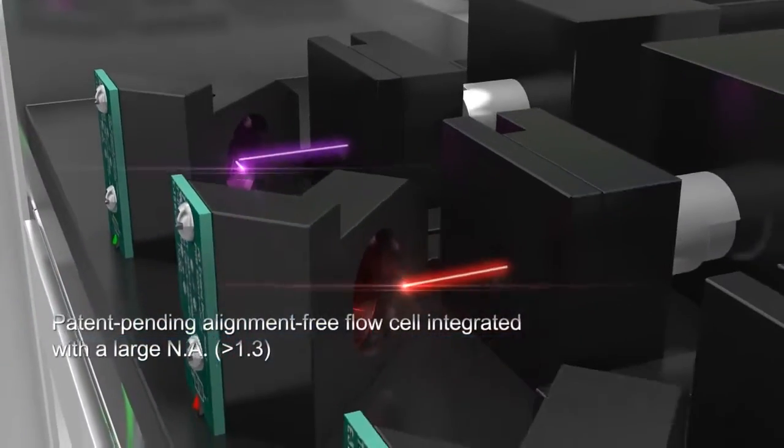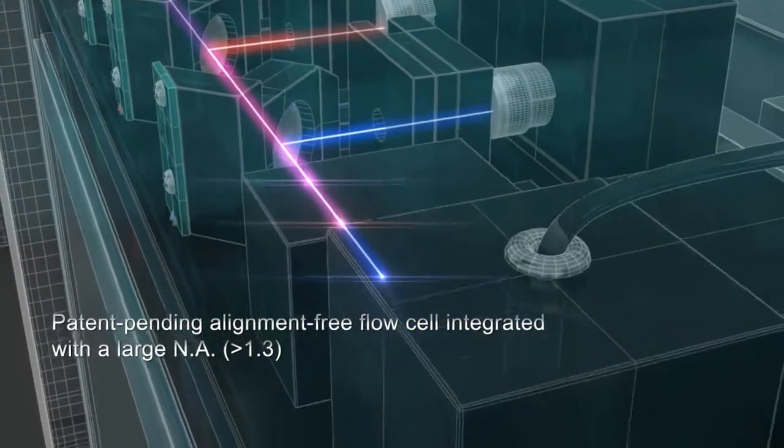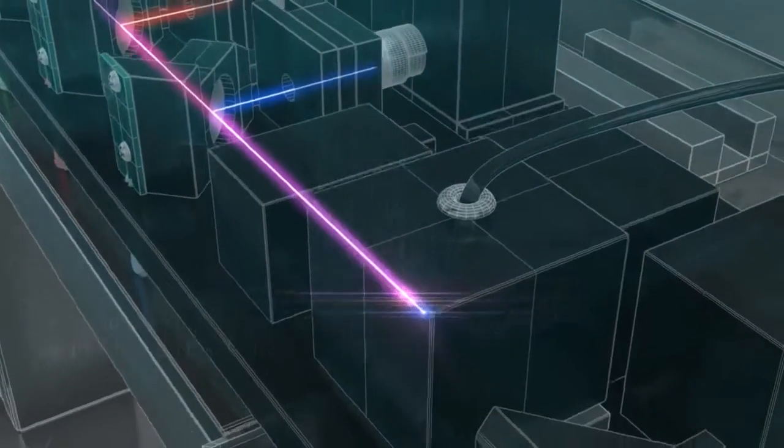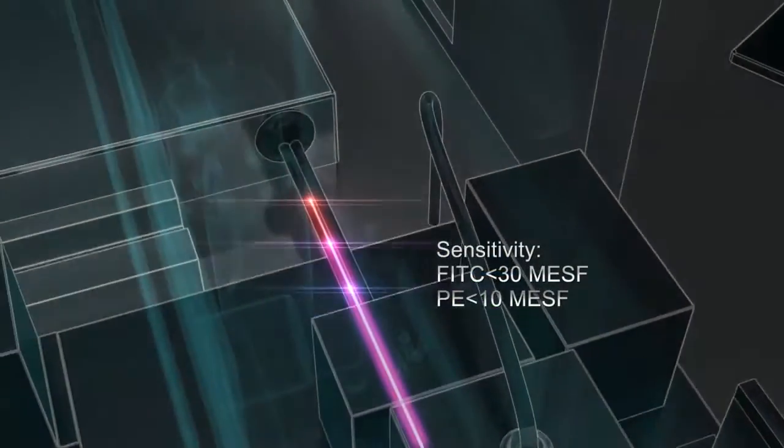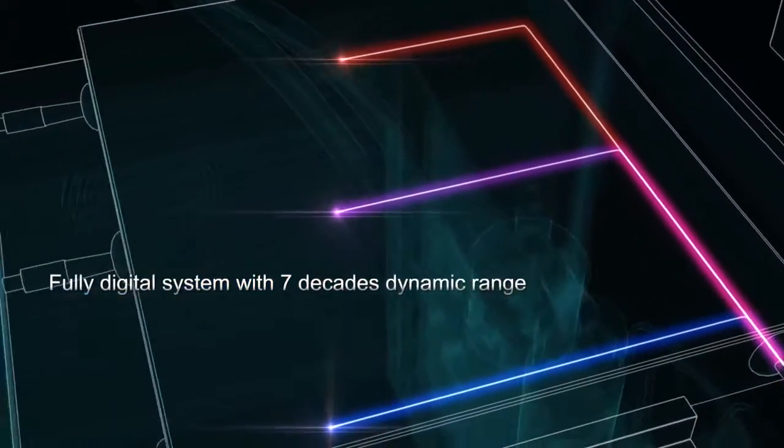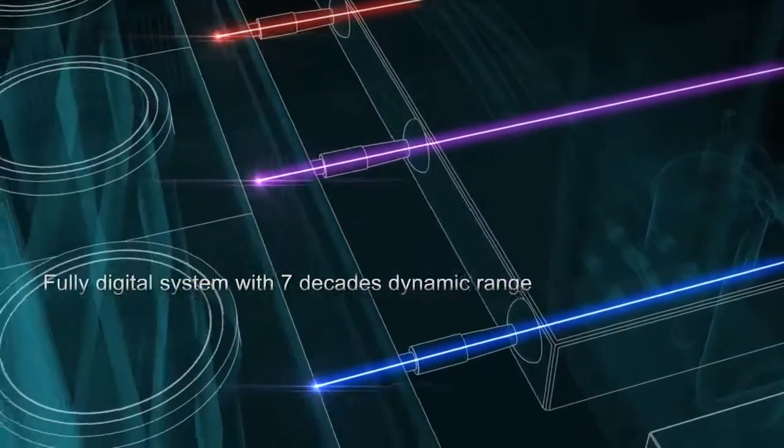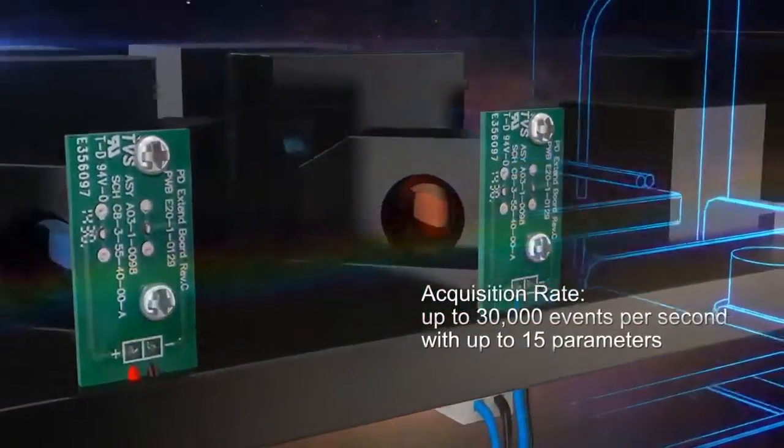It's what's inside the CytoFLEX that helps you get the most out of your data. High performance lasers are focused on an innovative flow cell design with integrated optics. Fluorescence signals are then focused through wavelength specific fiber optics onto patent pending wavelength division multiplexing detection technology in order to deliver superior performance.